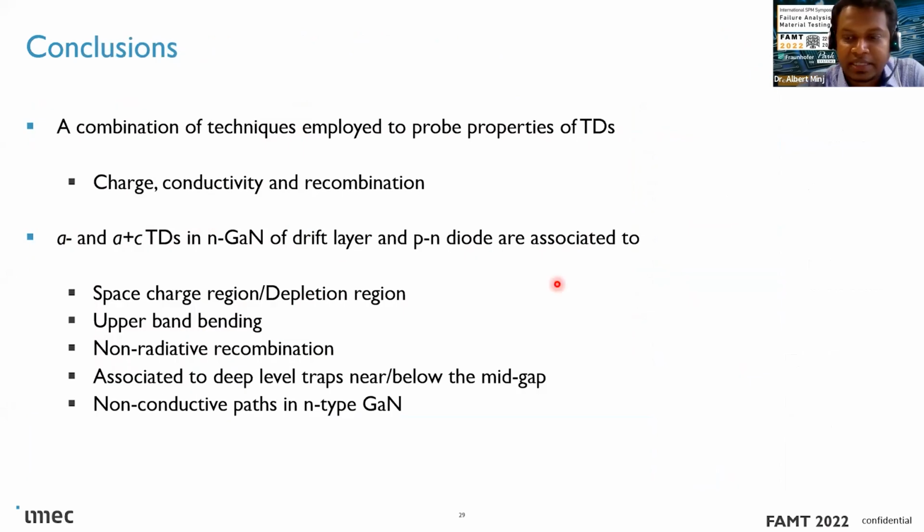So I hope I didn't go too fast or too slow. In conclusion, we used a combination of techniques with different electrical modes of scanning probe microscopy, combined with electron microscopy techniques, to evaluate charge, conductivity, and recombination properties. And we came up with one particular conclusive theory.